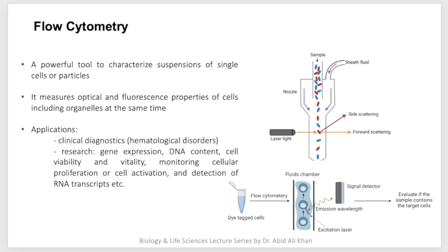An example would be if you run a bacterial cell, which is pretty small in comparison to, let's say, a eukaryotic cell. If the forward scatter is plotted on the x-axis and bacteria is at 0.1 in the forward scatter, a eukaryotic cell would be much bigger. Let's suppose it will be at value number 6 or 7, whatever units you are using here.